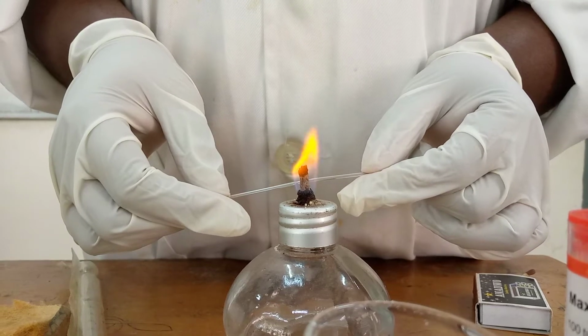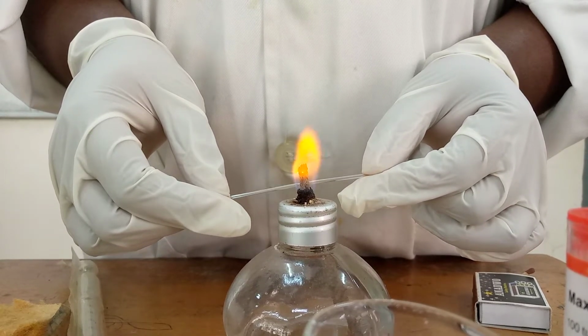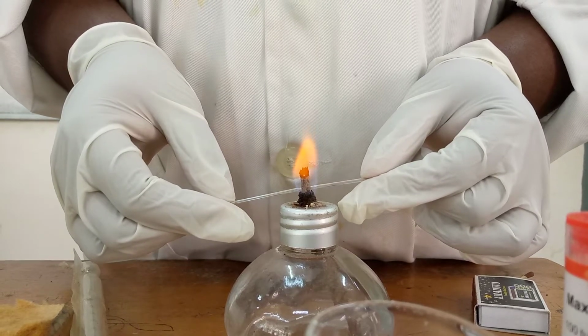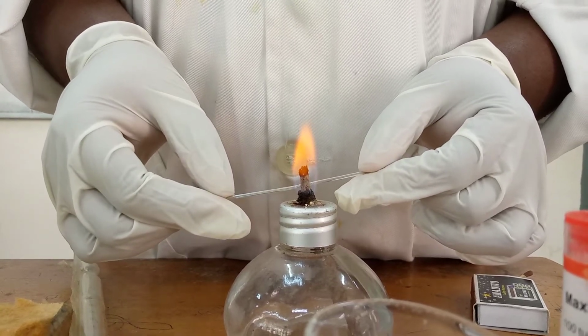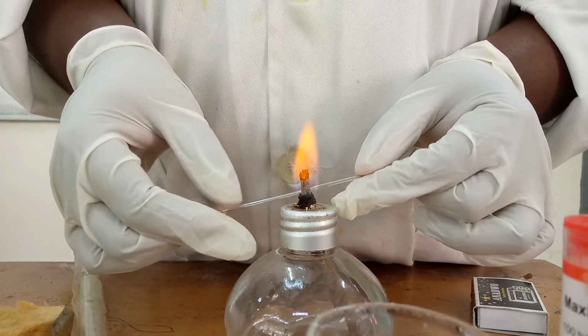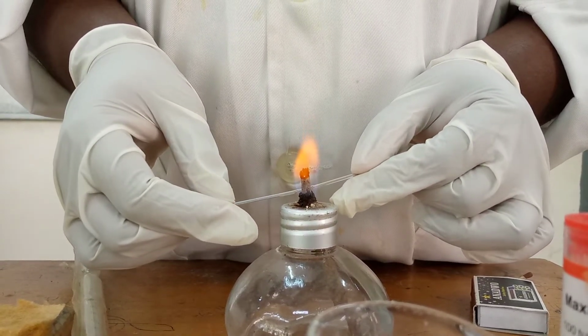Now the best lamp to use is the Bunsen burner, because the Bunsen burner has the blue flame. But if you don't have the Bunsen burner and you have the ethanol lamp, you can use it. So it is melting. You have to be really patient.